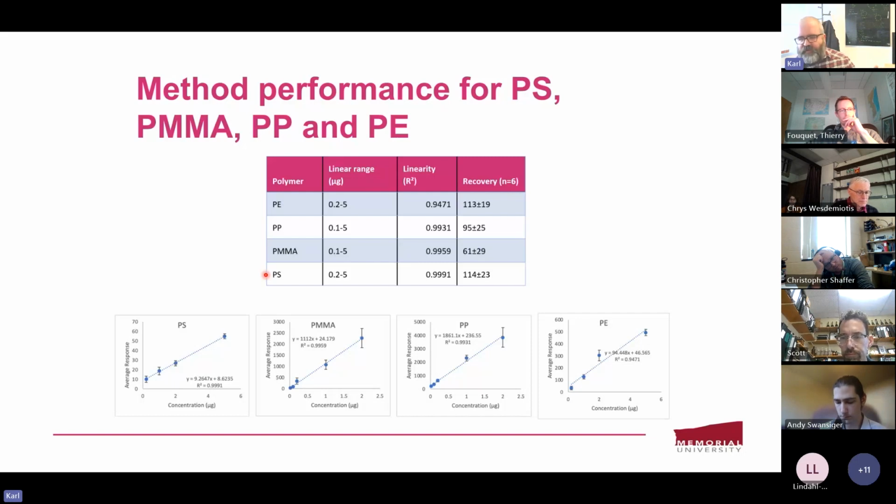We haven't done that here. We found that it's more convenient to do the dissolution in a mixture of methanol and DCM that roughly matches the density of the polymer.